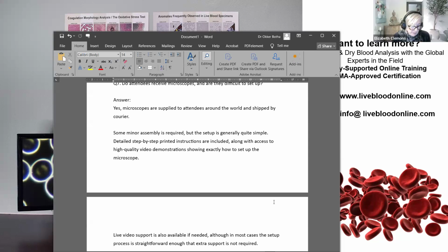Thank you. And can live blood analysis show issues related to EMF exposure, electromagnetic frequency exposure? Yes, it can, and it is often used to conduct research in those fields, and especially with clients that have sensitivity to EMF. It's often used to establish what the underlying issue is, to work out what actually needs to be done, and to monitor their response during treatment as well. There are a number of patterns related to that we can see in the blood, and those can then be used to track progress during treatment.